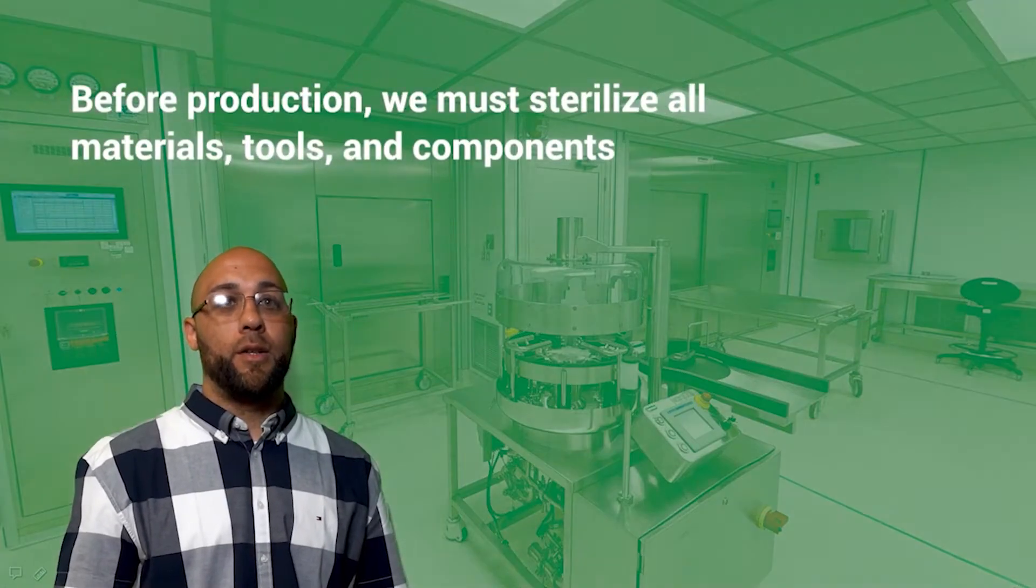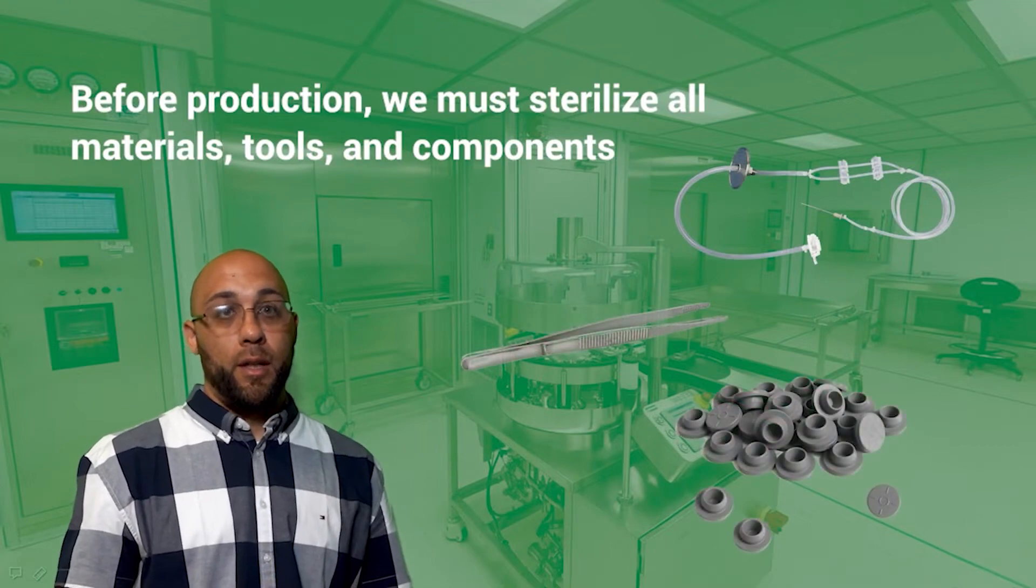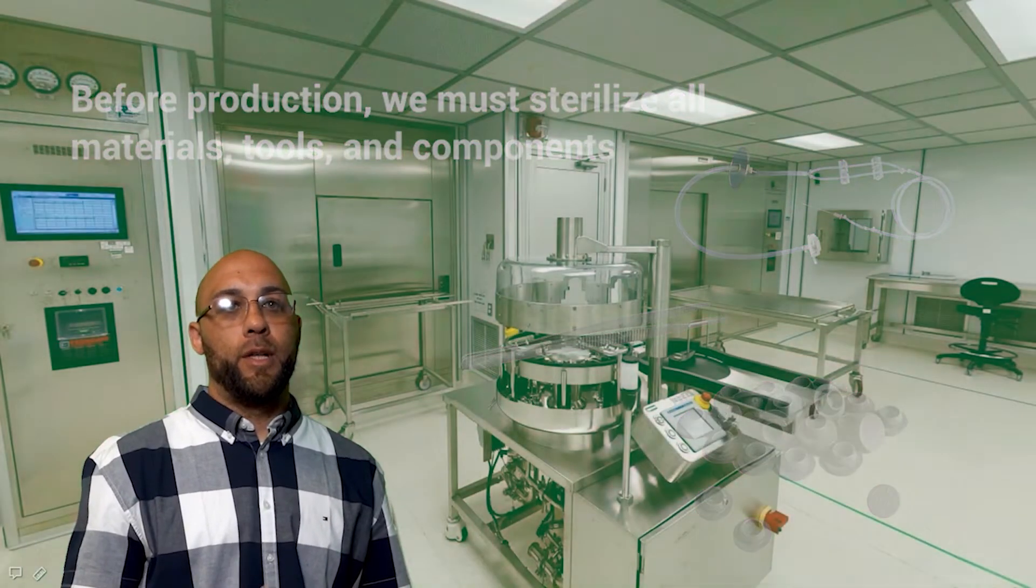Hi, I'm Wesley Williamson. I'm a supervisor of the component prep group at BSM. I've been on the BSM team for around two years. Before we can begin filling drug product, we must sterilize all the materials, tools, and components that we will use. That is what we do in our component prep room that you see now.